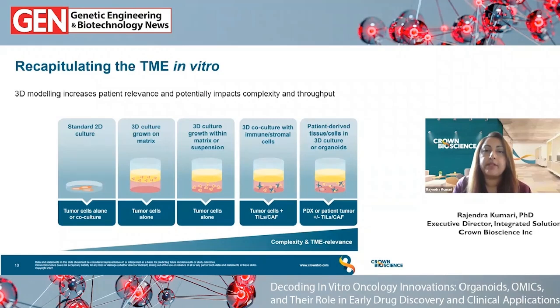So there are different types of in vitro cell-based assays, especially in how the 3D cultures are constructed. And this is represented in this figure here. So you have your standard 2D assays with the cells cultured in flat monolayer using homogeneous cell population. This is shown on the left-hand side. And you can even use cells from the primary tissue if there is a stable culture that can be achieved.